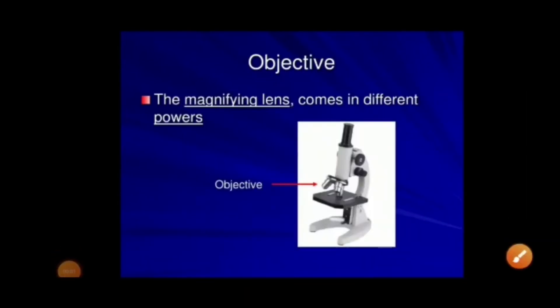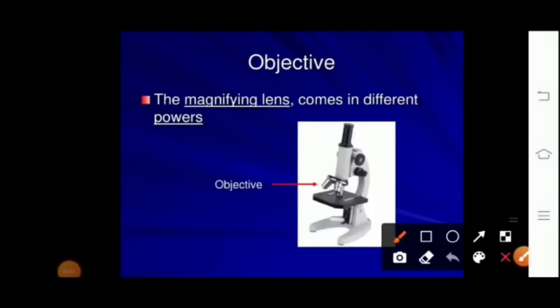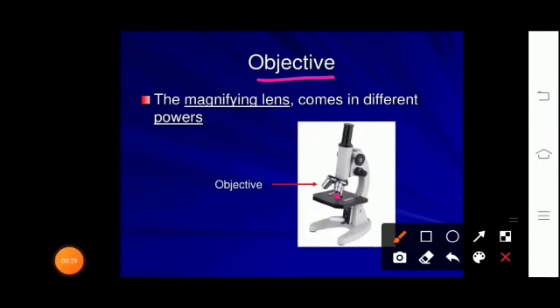The second optical part is called the objective lens. It is called the objective lens because it directly comes into contact with the object we are going to view. It also has certain magnifications such as 5x, 10x, 25x, 45x, or 100x. Through this, we can easily see microorganisms or very small cells.